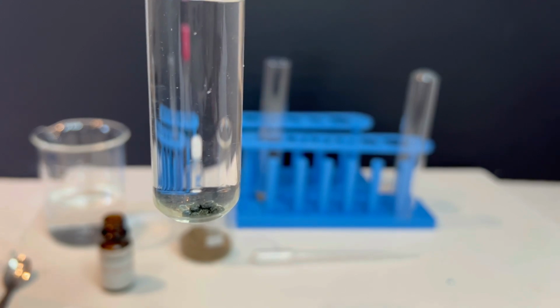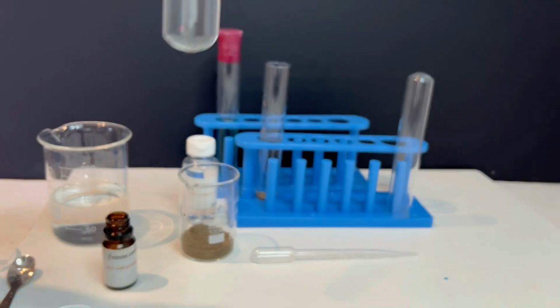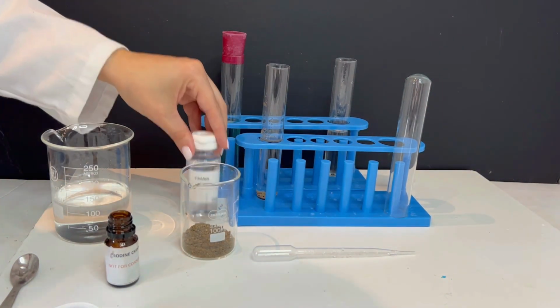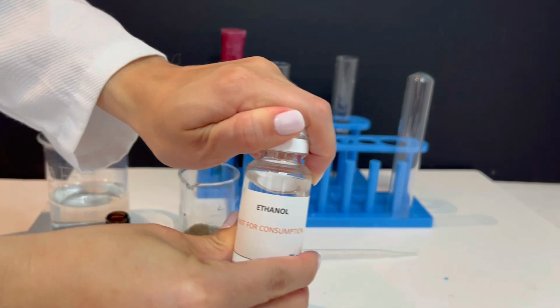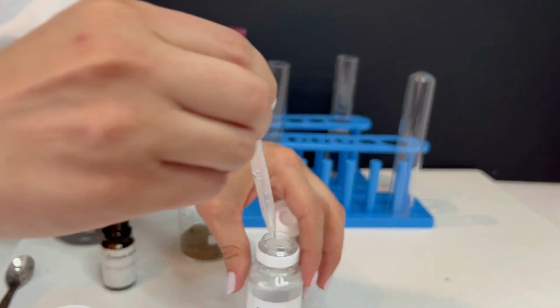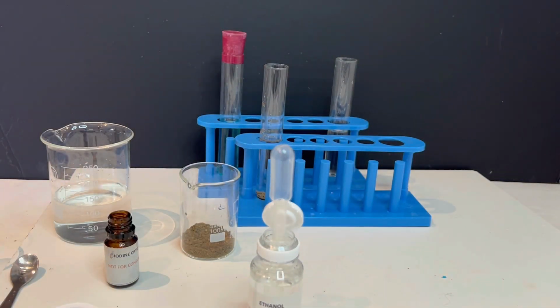Some iodine crystals dissolve while others remain suspended. This indicates a heterogeneous mixture. Lastly, we add ethanol and a spatula of iodine crystals to the fourth test tube, and then we mix it.